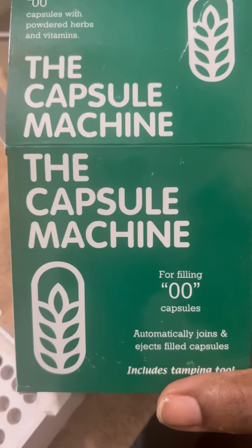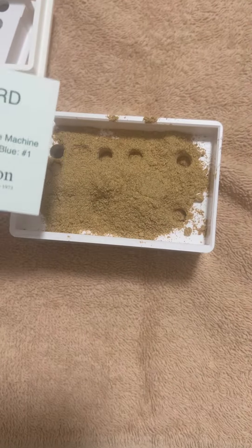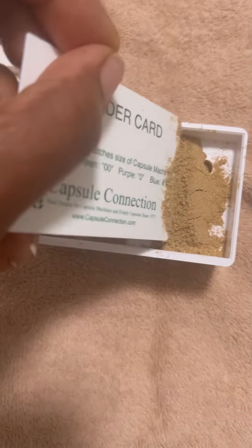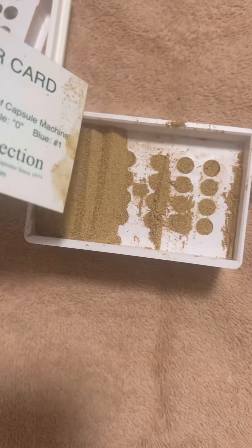Greetings creators. Today I want to share with you the capsule machine. I purchased this machine because I have so many loose herbs that are really bitter and disgusting in taste but so good for you. So I thought I'd learn to make my own capsules.